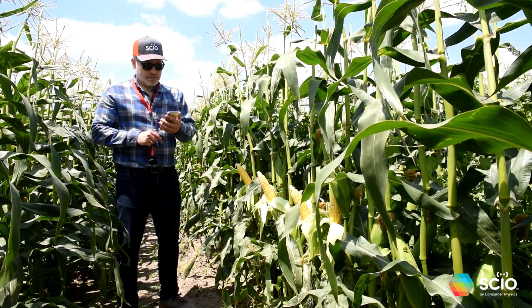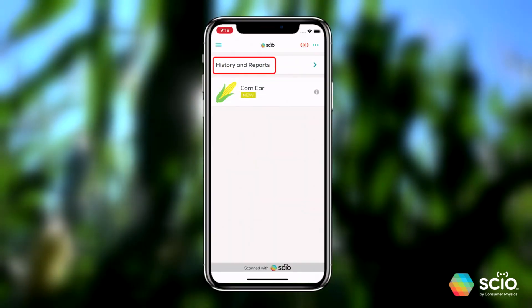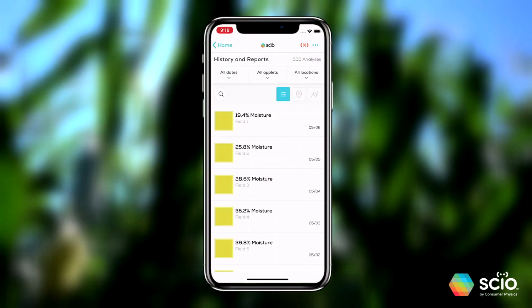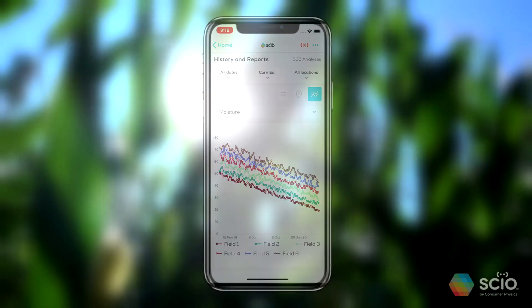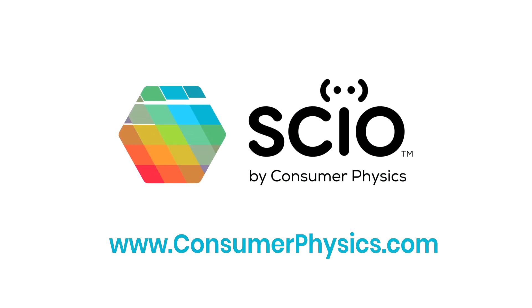That's it — it's that simple. You can always go back and track results across time and location by clicking on the Trends button in the results screen. SIO by Consumer Physics.